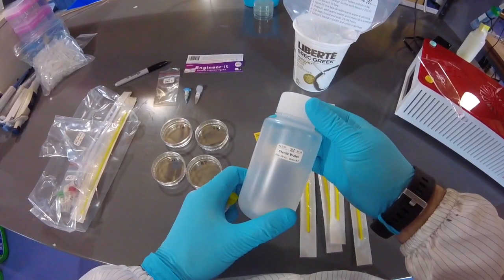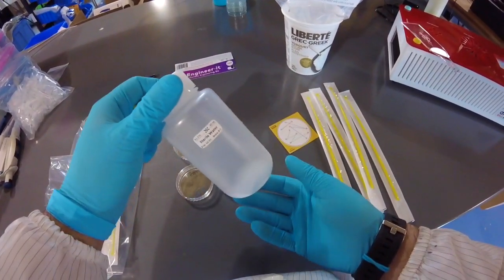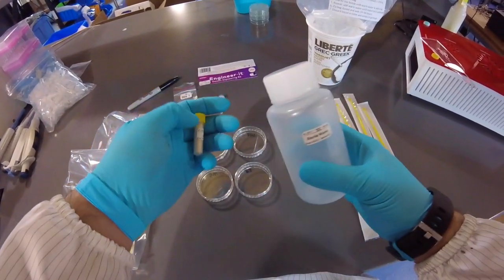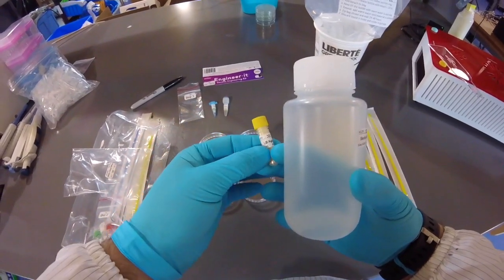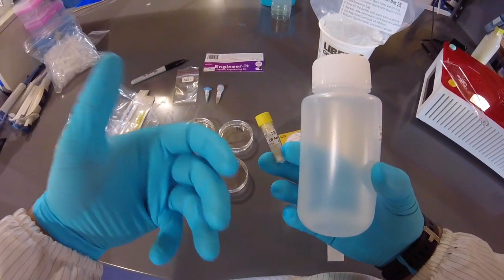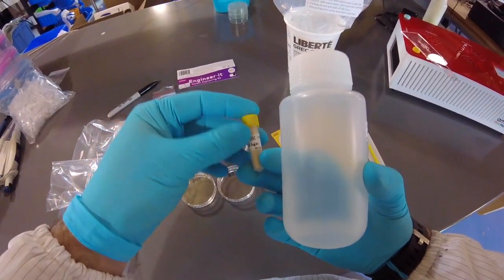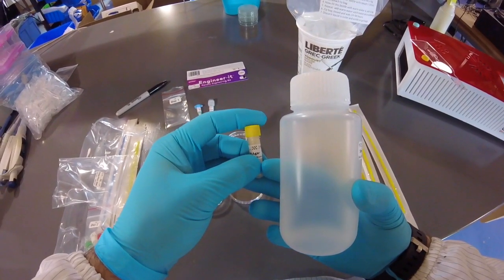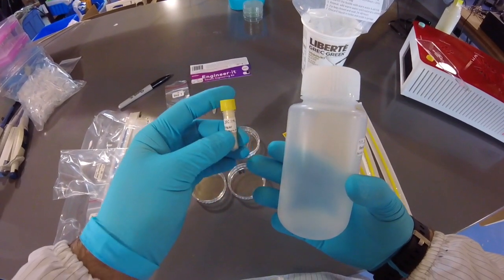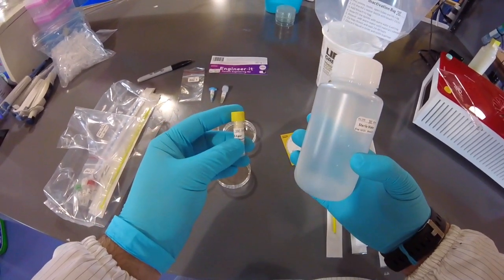And before we do that, I just want to stress how important it is to get the water boiling. Okay, so the objective here is to get a rolling boil in the water. And this is because LB agar is comprised of LB, which is the amino acids, the sugars, the minerals that the bacteria grow upon. So they eat that and they grow with it. And then the agar is, it's sort of like gelatin, except it comes from ocean plants. And in order to dissolve that agar, you need to have at least 85 degrees Celsius water, okay?